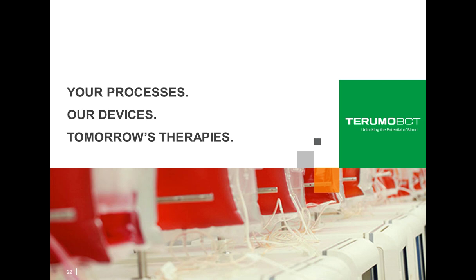Thank you. Your next one is, how do you get the cells out of the quantum system?